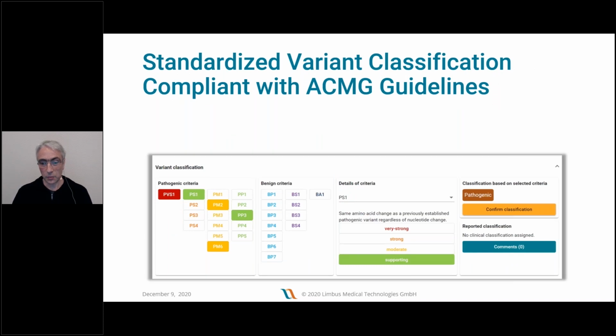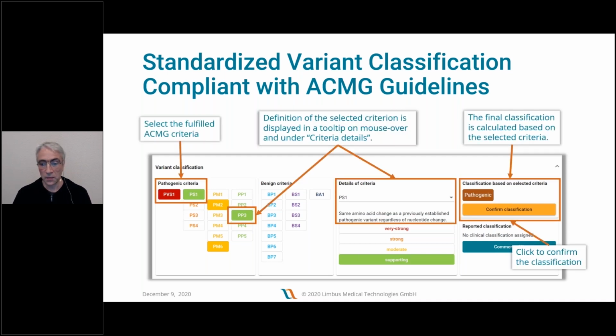And as Andreas Lana pointed out, it is extremely important that you and your team and your diagnostic team comply with standards and work in the same way, in a systematic and consistent way with variant classification. So we support the use of the ACMG guidelines and provide you with a calculator that nicely allows you to document how you came up with a specific classification. So the criteria that you enter in the software tool are stored with the variant, are stored in the database, and are available for any future review or for any other patient that you are going to see this classification in.